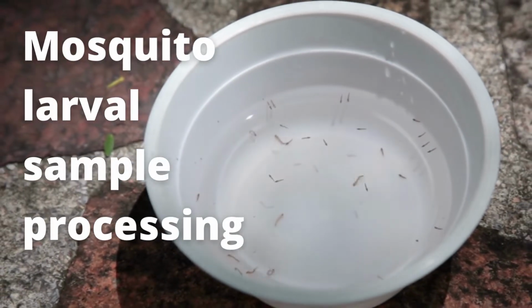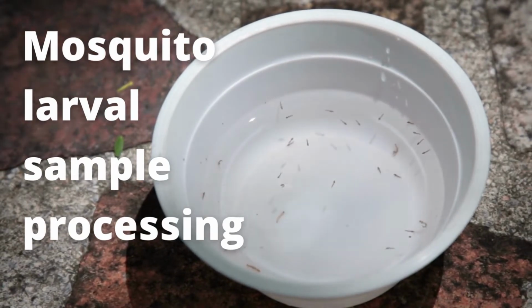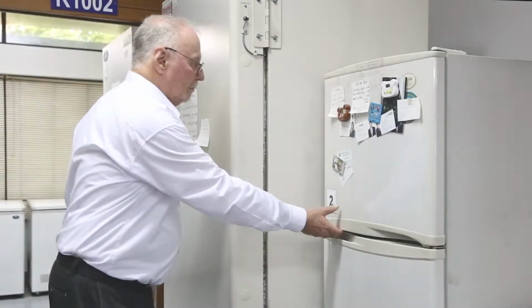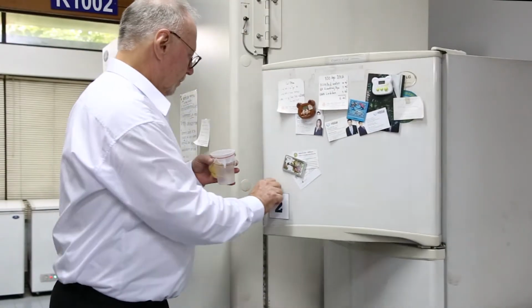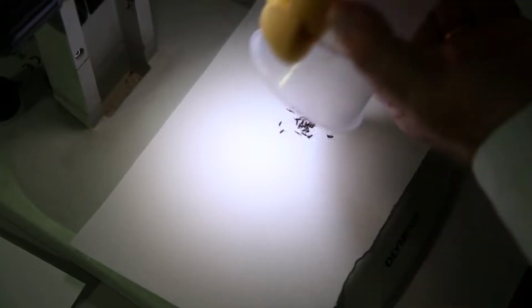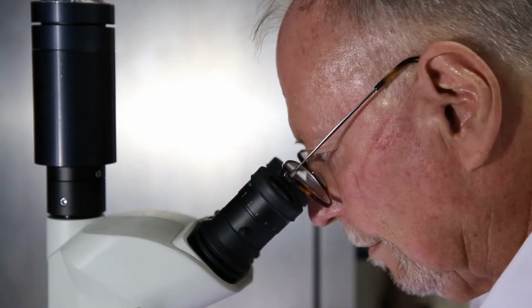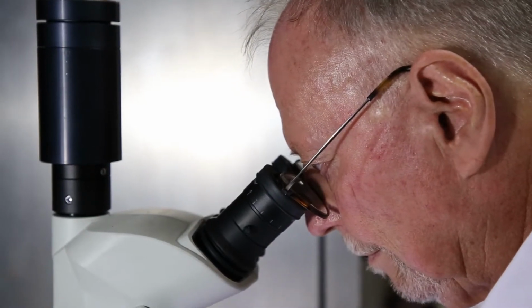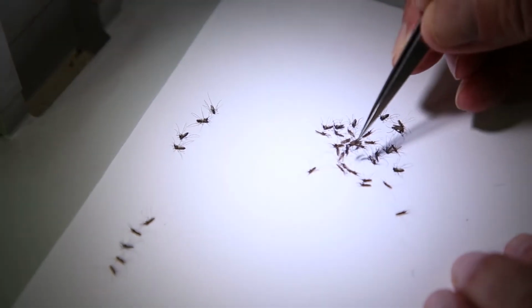In this tutorial, we will be discussing how to process mosquito larval samples. Mosquito larvae are collected for different purposes. Most of the time, you simply want to know what species of mosquitoes are breeding at particular sites. So for most field collections, you want to identify the larvae. You can do this in two ways.